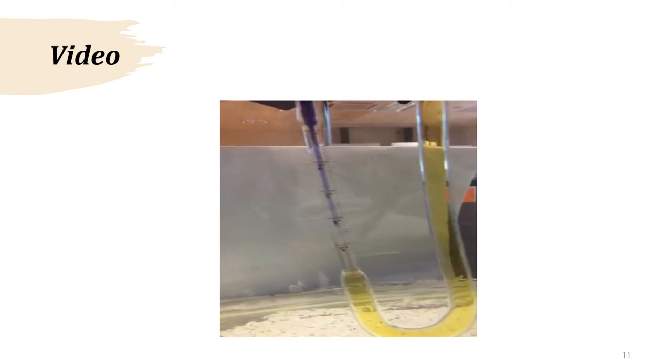Right, for this particular lab, I do not have any assignment for you, as in no lab reports are required. However, I did ask you a question just now, that there is also another method to measure this ionic transport number. So what is the other method?